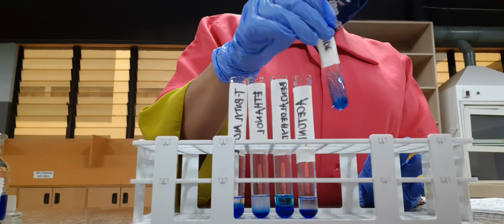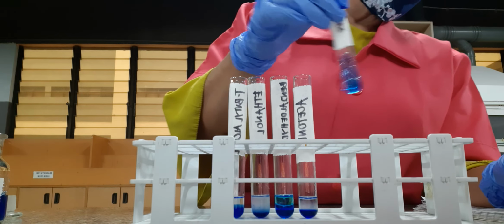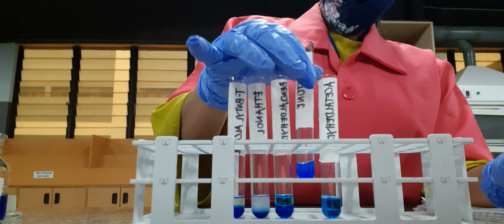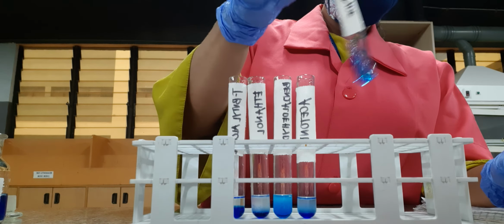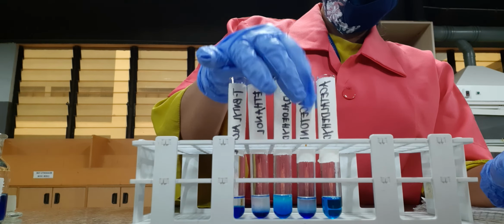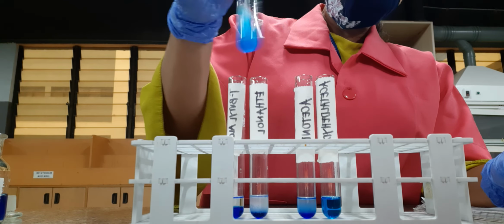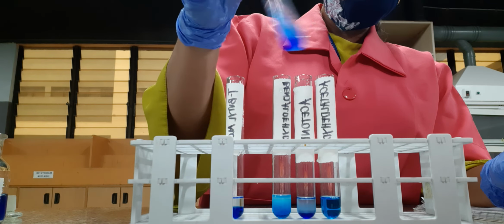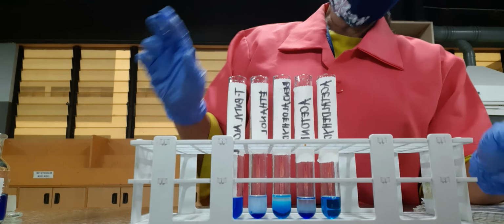Okay, so take note of the color development before we subject them to hot water bath. Okay? So before we subject them to water bath. So we're gonna shake. This is our acetaldehyde with Fehling's reagent, our acetone with Fehling's reagent, and our benzaldehyde with Fehling's reagent, our ethanol with Fehling's reagent, and also our tert butyl alcohol with Fehling's reagent.